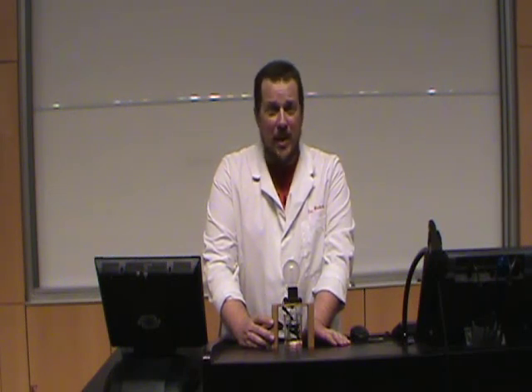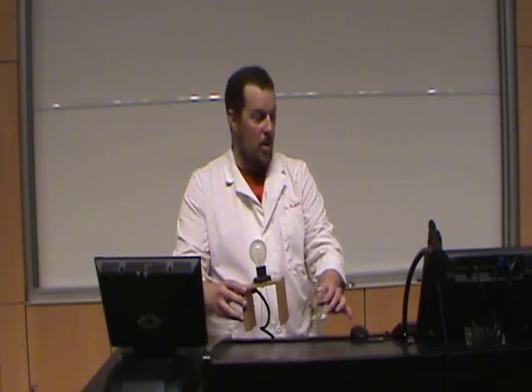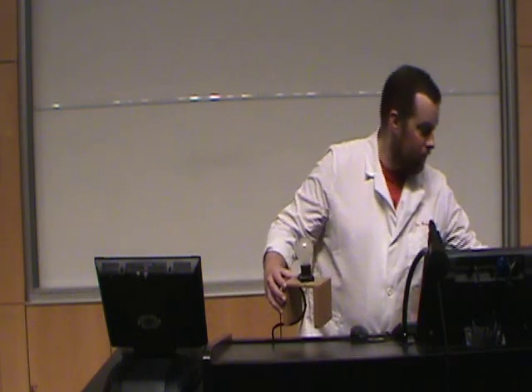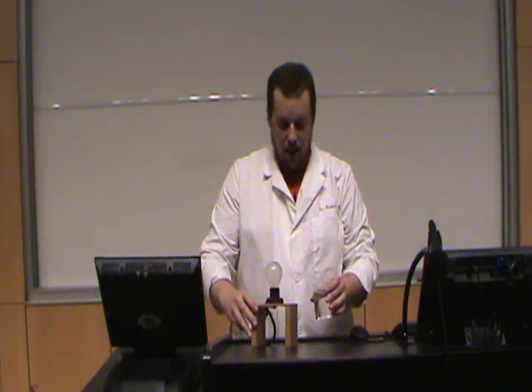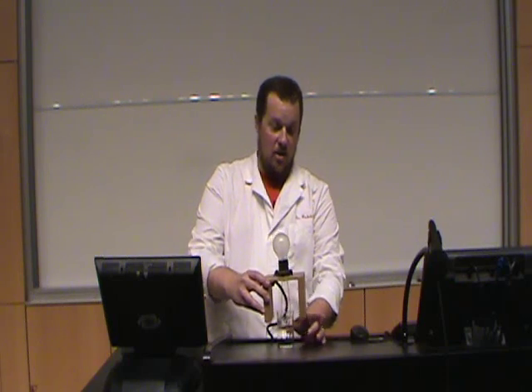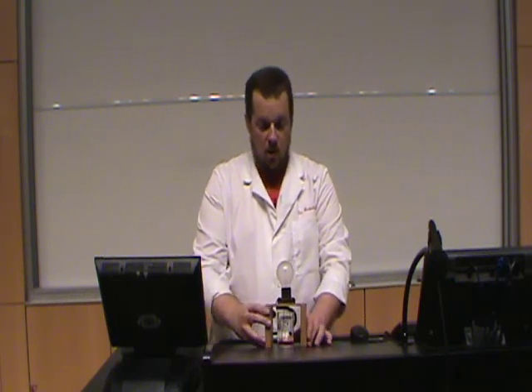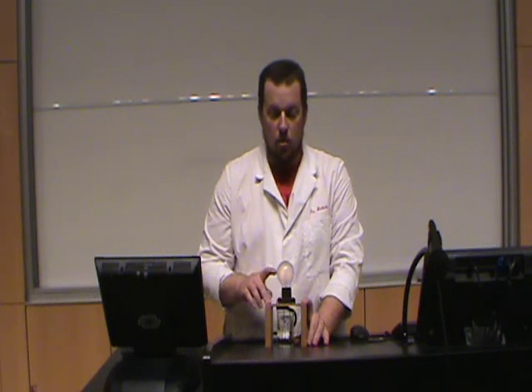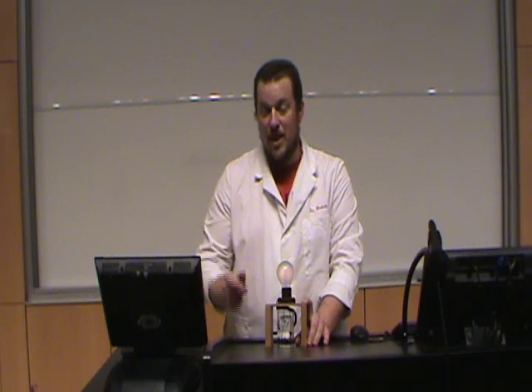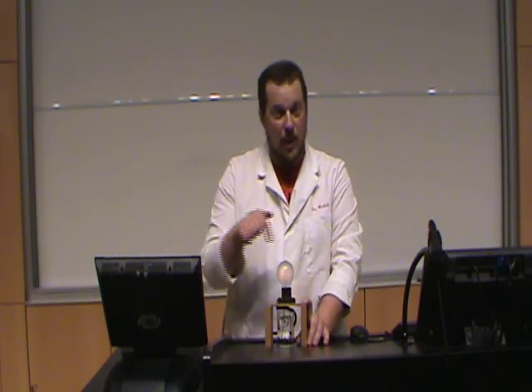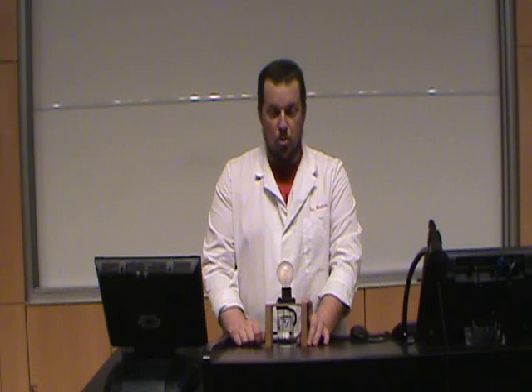What about the tap water in lab? We've got to be really careful about running our experiments using tap water. If I take a beaker that has tap water — this is the tap water that came out of our labs — and put my conductivity tester in it, it's starting to glow. That means the water in our labs contains ions, and it contains enough ions to allow some electricity to flow through that solution.